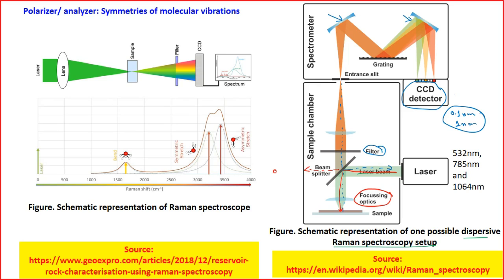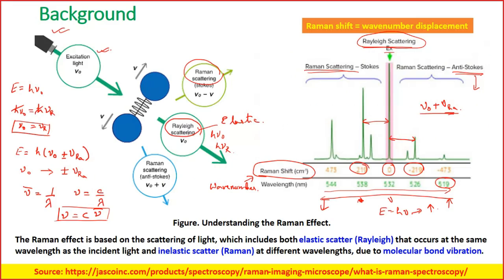Sir, how will we be using this Raman spectroscopy in API concentration? I told you, yesterday only I told you. Suppose you have these peaks.